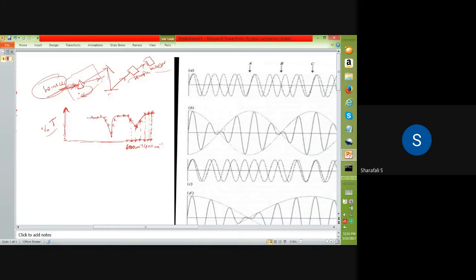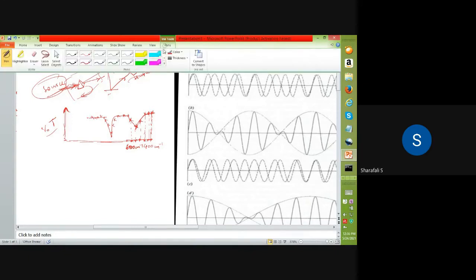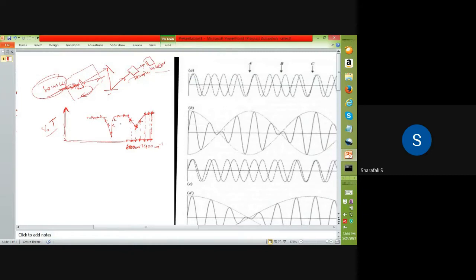And if you want to take the same spectra again to avoid the noise, to have a confirmation on the spectra, you have to take these spectra several times, and you have to magnify this spectral intensity by using the same technique.